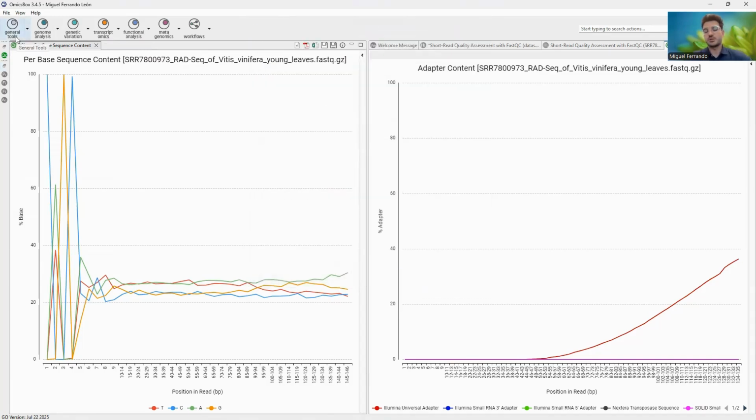So now our sequences are clean and they are ready for the next phase of the analysis, which is the variant discovery phase. In this phase, we first need to do the mapping, DNA-Seq alignment, and generate BAM files for the calling step.